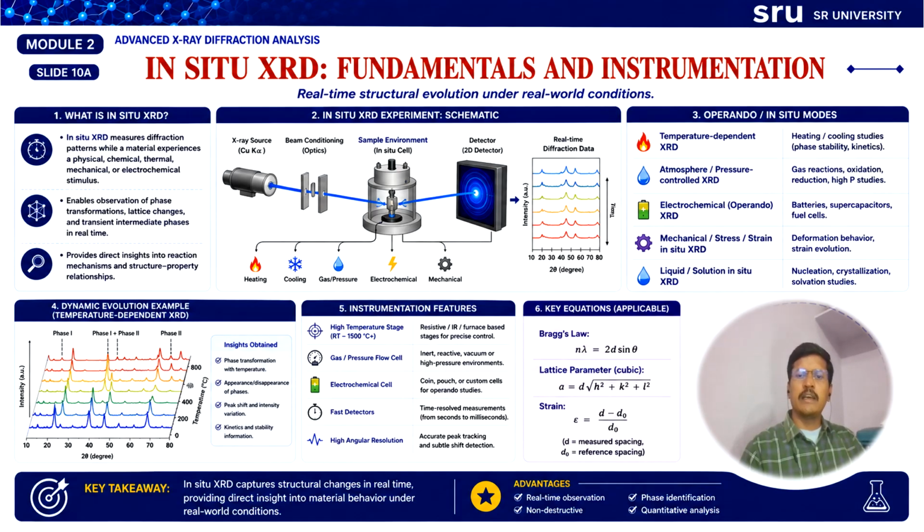Now, let us understand the experimental setup shown in the in situ instrument. The X-ray beam passes through the specialized sample environment such as a heating stage, gas chamber, electrochemical cell, or mechanical loading system.